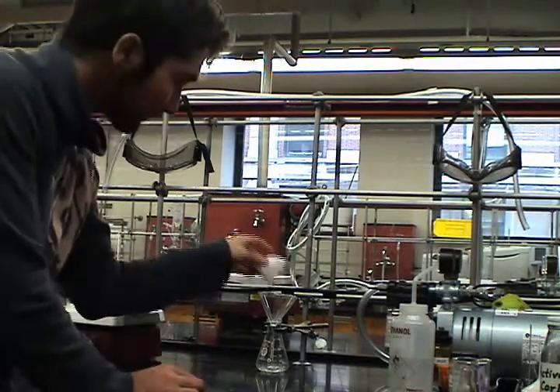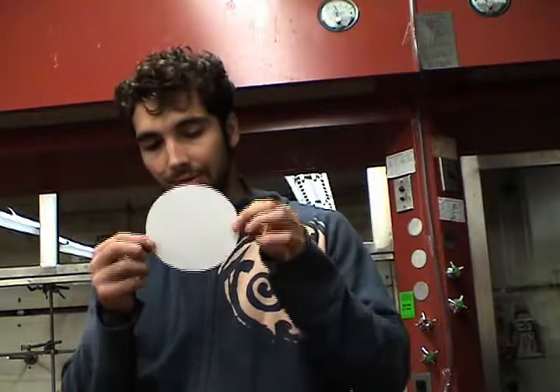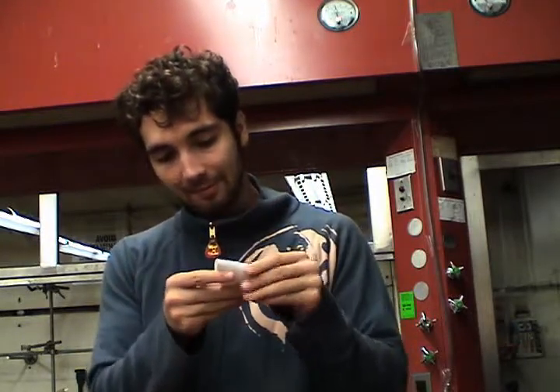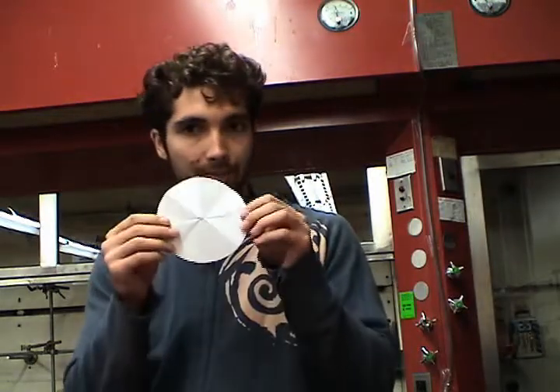I'll teach you how right now. Take out a piece of filter paper — I'll start with a plain circle. Fold it in half, and then fold it in quarters, and then fold it into eighths. And unfold it.